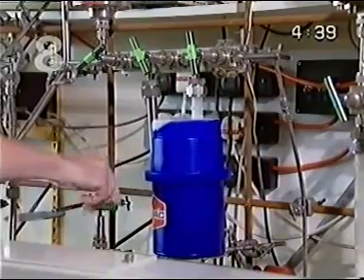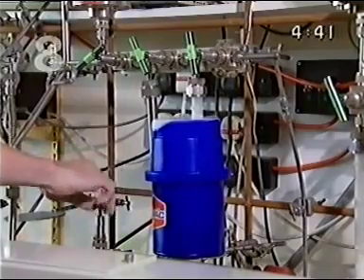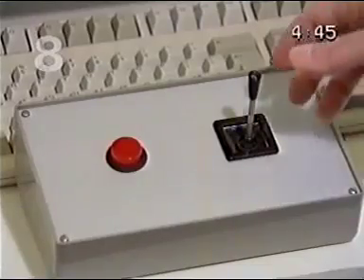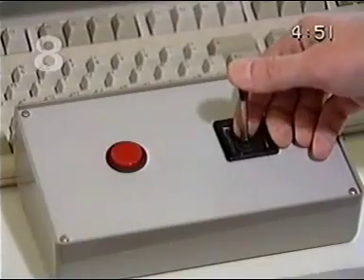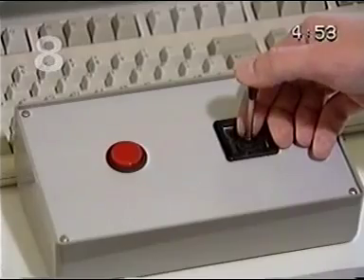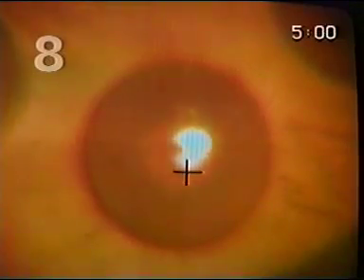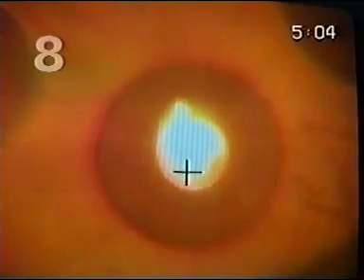The compound containing fluorine is introduced from a liquid nitrogen trap, and the meteorite for which data is required is heated by selectively focusing a laser through the optics of a microscope and scanning the beam backwards and forwards across the sample so that the reaction proceeds. The liberated oxygen gas is collected and taken into the mass spectrometer for measurement.